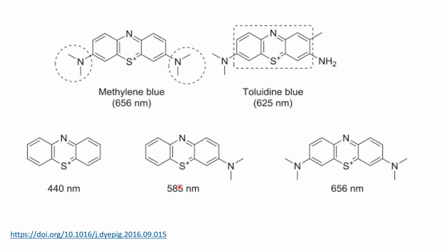It means it intensifies or strengthens, or usually darkens the color of the stain. And if we add more functional groups of nitrogen, we further increase the energy absorbing capacity of our dye.